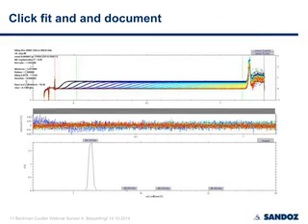Then you may fit this and document it by integrating it and reporting it. I always check the RMSD, which should be in the range of 0.005, and you may track it over time. Although the absolute value is not that interesting, it gives you hints over time if your lamp gets dirty, or if you have a problem, for example, with the buffer which you use for dilution. So I track this and also report it every time I report an analysis.